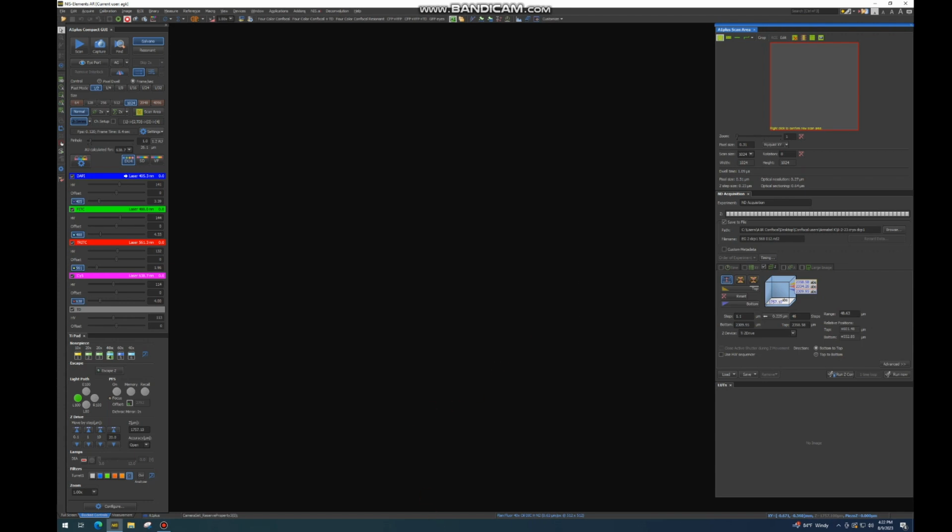So the last thing that I will briefly go through is directing an image to a specific file. So we ask that everybody save their images in a folder titled with their name within a folder called Confocal's users. And the reason we do this is because this is not a storage software, and we will frequently go through and delete images.